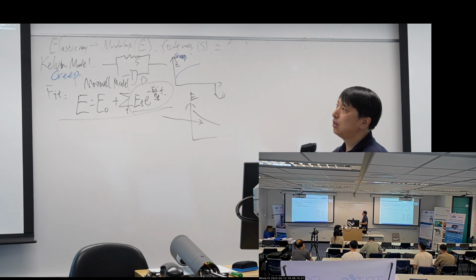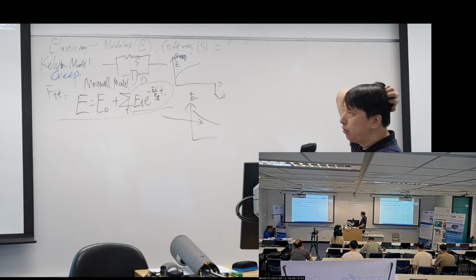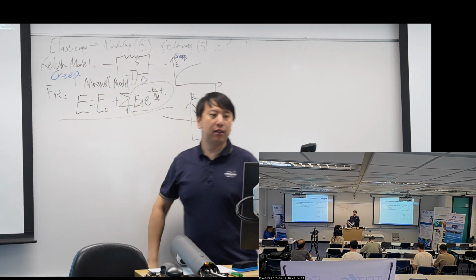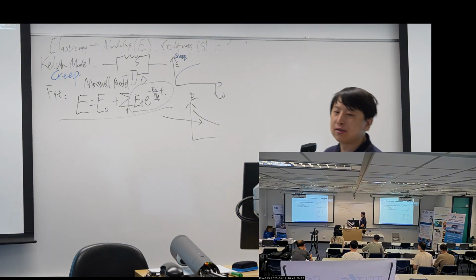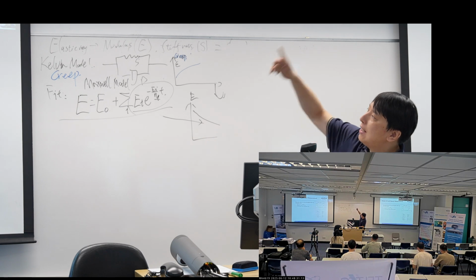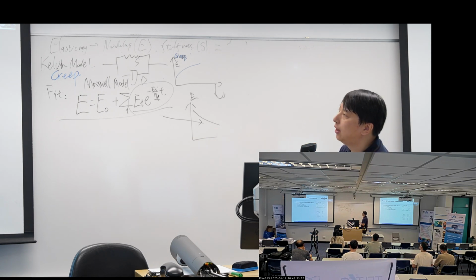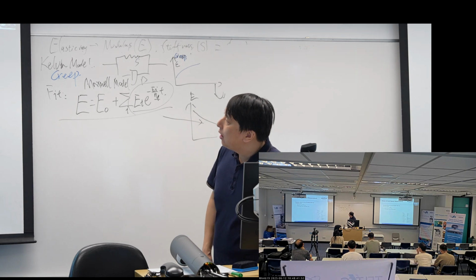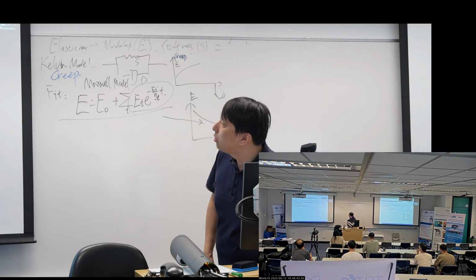For this ramp and hold function, it is just used to do the viscoelasticity. They want to repeat relaxation and creep on the force curves.